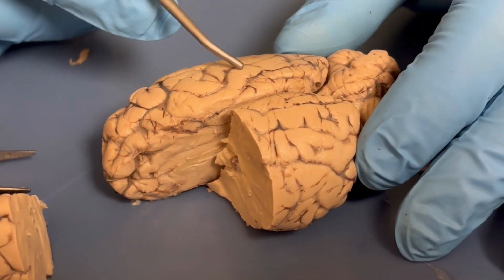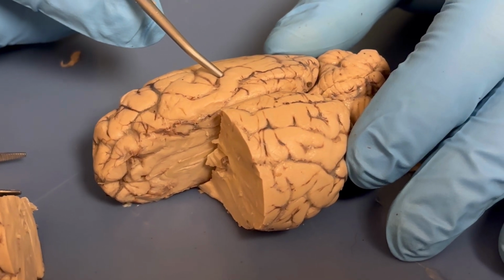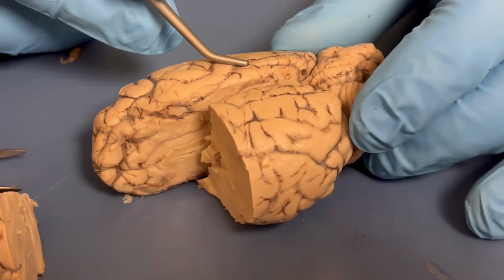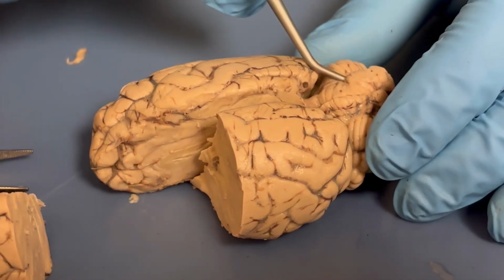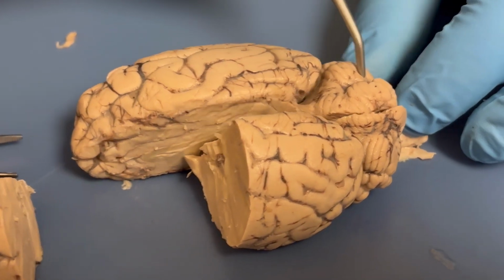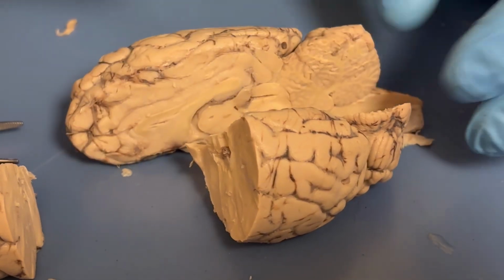Next, we have the gyri. These are little folds you can see all around the brain, which create a larger surface area in the brain for increased cognitive function. Next is the cerebellum. This region of the brain is responsible for voluntary motor function and controls our balance and awareness of our body and how we move.